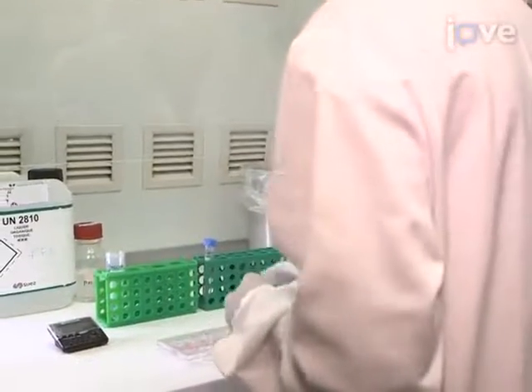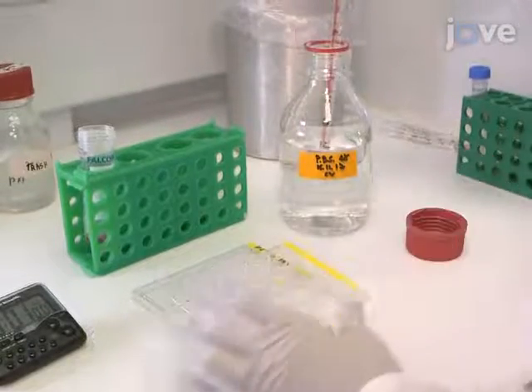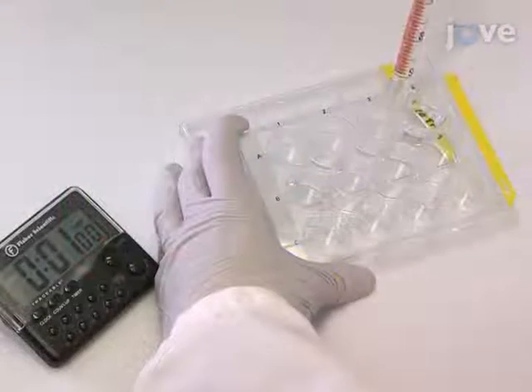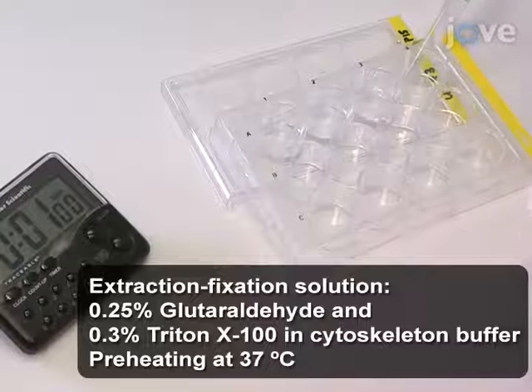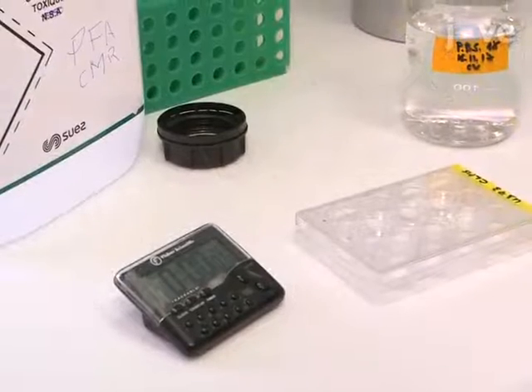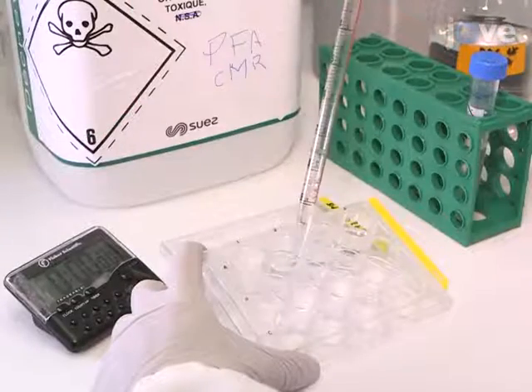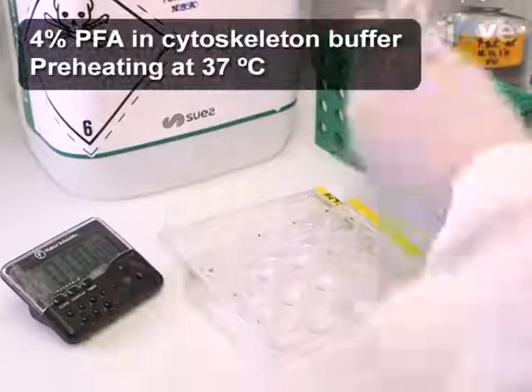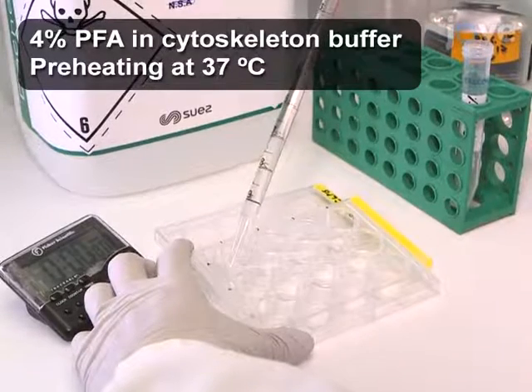After growing U373 cells according to the TEX protocol, fix the cells by first using PBS to wash them once. Then remove the PBS and add 1 milliliter per well of preheated extraction fixation solution. Incubate the cells at room temperature for 60 seconds, then remove the solution and add 1 milliliter per well of freshly prepared and preheated 4% PFA diluted in cytoskeleton buffer.